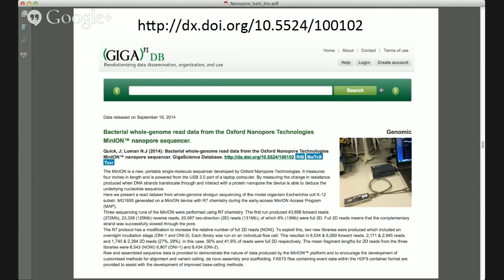These are some of the newer flow cells that we've run with R7 chemistry. This data has been available for a little while, if I've sent you the link, but that was coming off my server in Birmingham, and I didn't want to kill it. And so we've actually put this data up onto GigaDB with the help of Scott Edmonds from GigaScience, and that's a citable DOI. You can do anything you like with it.